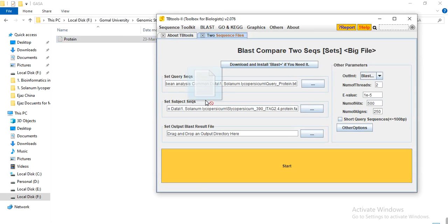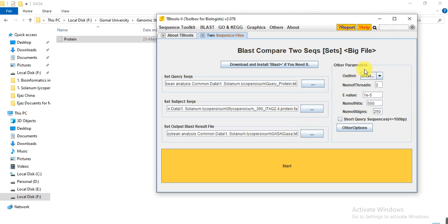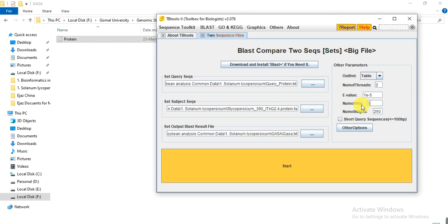Here you can drag it and name the output file — for example, GASA.txt. From the output format, select table. For the number of hits from each query, select five. Then click Start. The BLAST analysis has started and is now running.